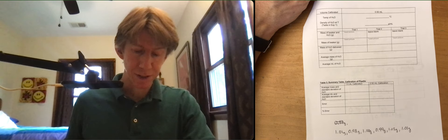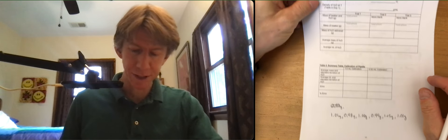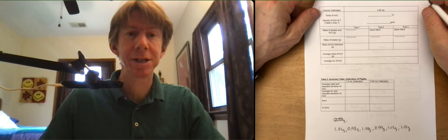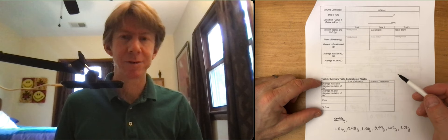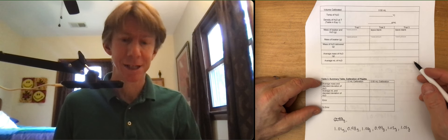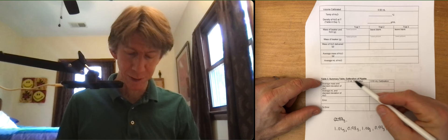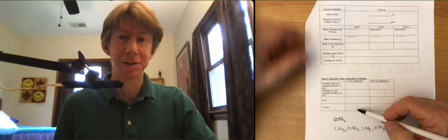Now for table number three which is your summary table for the calibration of the pipette. You'll have to make a summary table for the calibration of the graduated cylinder and of course it will look very similar to this except it will just say graduated cylinder here and you'll do all of these calculations.